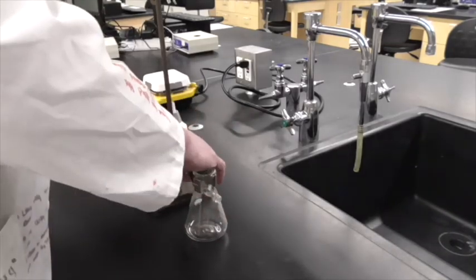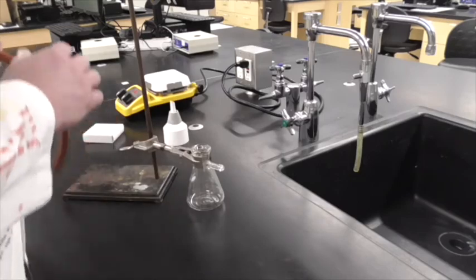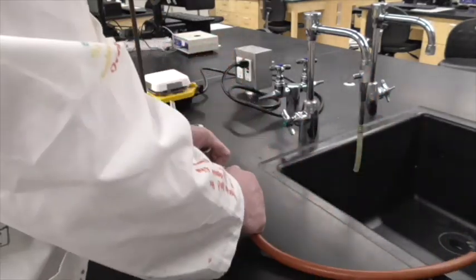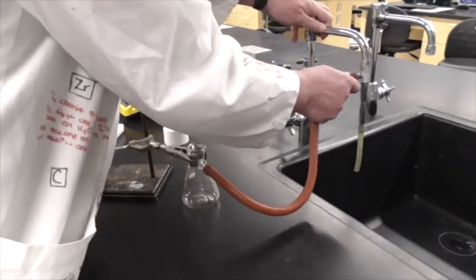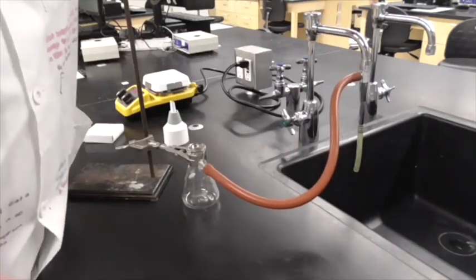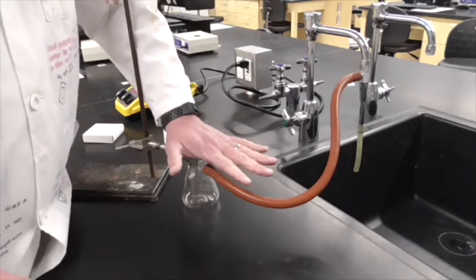Okay, so I've got the sidearm attached to our ring stand, just to keep it steady. And then I've got the tube. I'm going to attach the tube to the sidearm, and then this goes on the sidearm of the water faucet. So what's going to happen is that when we turn on the water, as the water flows past this sidearm, it pulls the air into it. So it's going to cause a vacuum to occur over here.